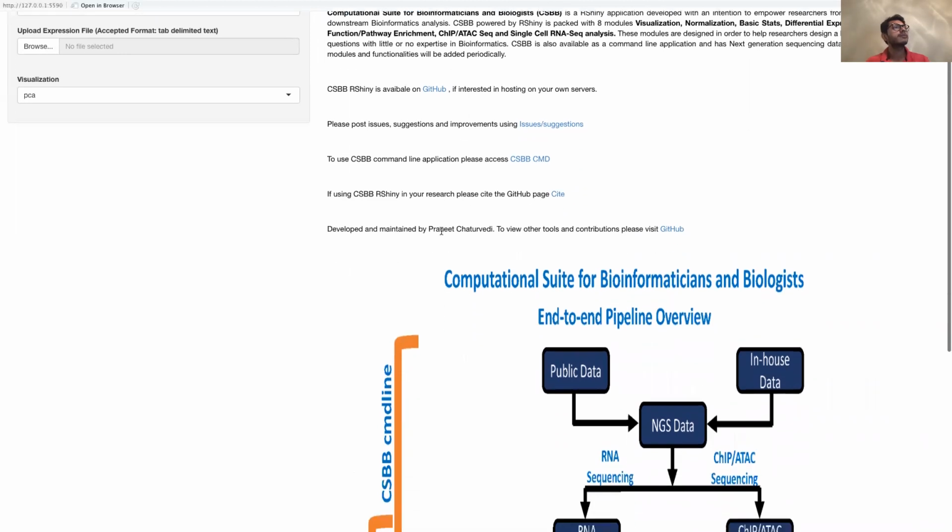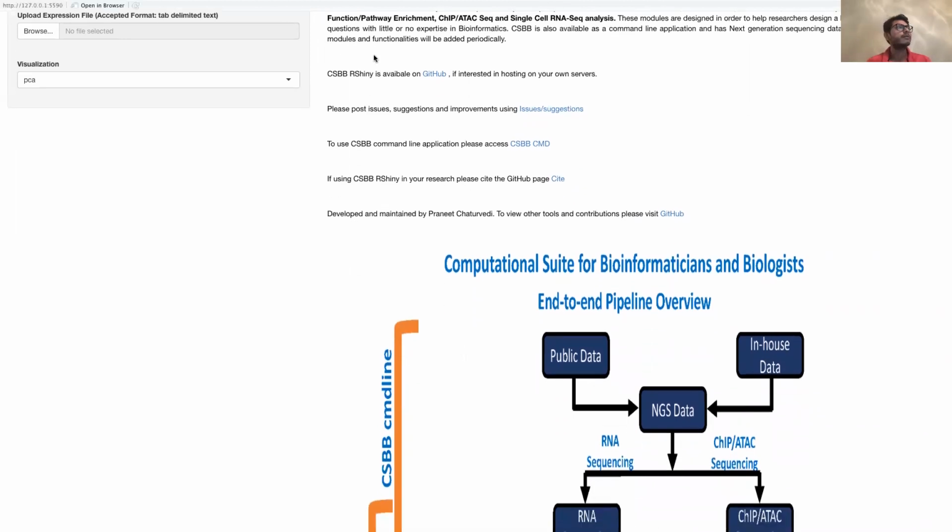Just to give you a quick overview, this is available on GitHub. The whole code is on GitHub, and you are welcome to give your suggestions, improvements, and issues that you face. Also, you can use it on your own servers by deploying it on your own machines.